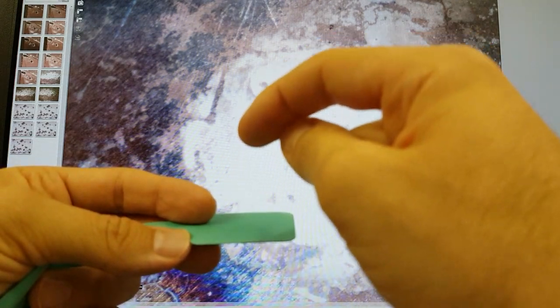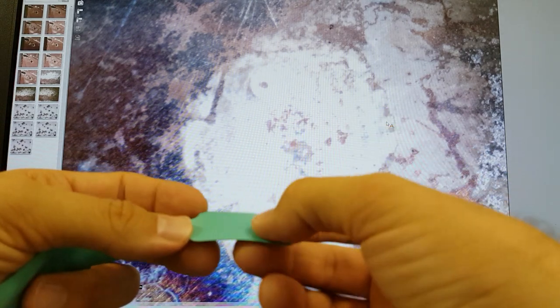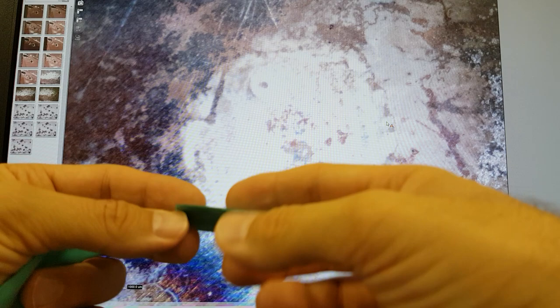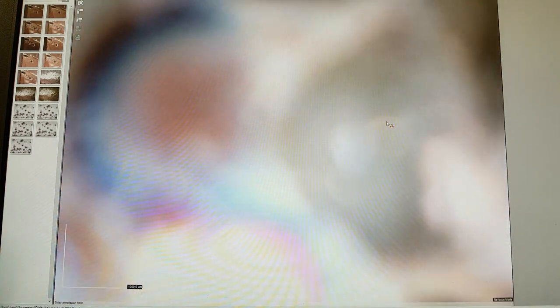You can imagine there were potentially some influences going through — certainly thermal influences. When I share some videos, you'll see things are often born underneath and they fizz around and then pop up from underneath, which is very interesting. So I thought I'd have a look at the other side. We're going to turn the polarizer off so you can see the kind of hexagon there, and the evil twin — there's our yin and yang.